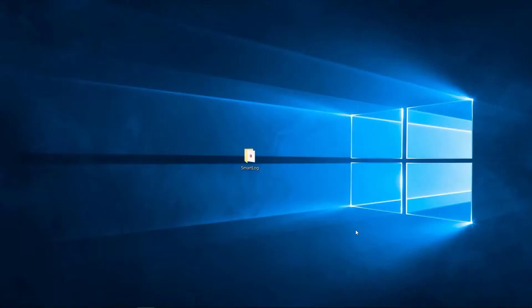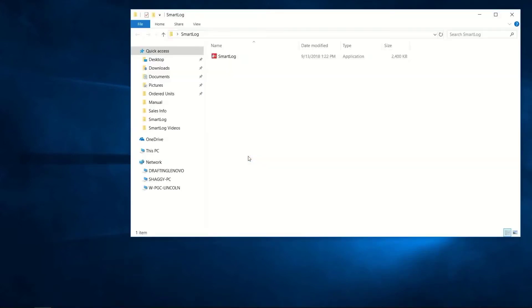To begin, navigate to the folder in which you've saved SmartLog and double-click on the icon.